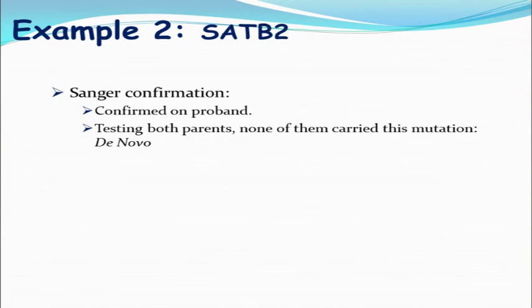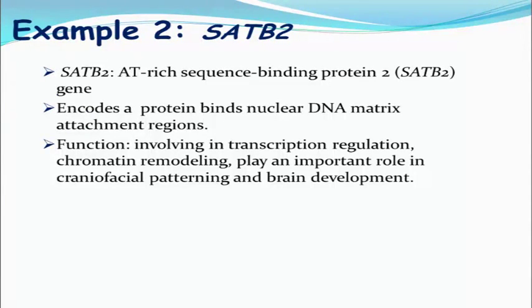For this variant, we did a Sanger confirmation on the proband, and we also tested both parents. Both parents showed they don't have this mutation, which means this is a de novo mutation. And here is the information on this gene.